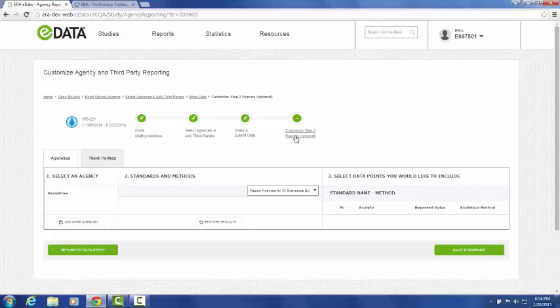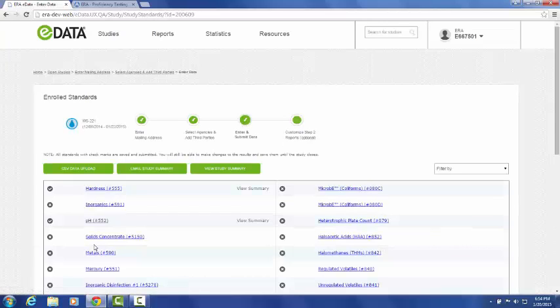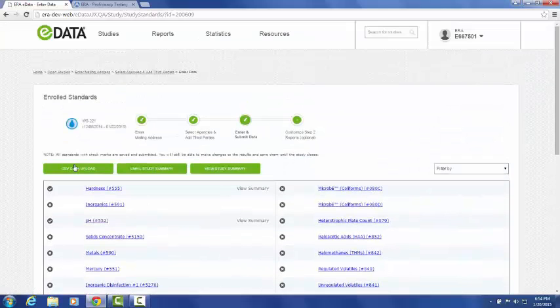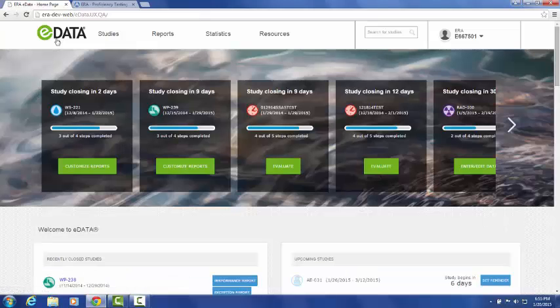If you do have questions about completing and customizing your reporting requirements to your various agencies, please contact ERA's PT group and I'll provide their contact information following the webinar. So let's go back to the data entry menu. Now once you've completed your data entry, you can use either the button provided to return to your open studies, or you can use the breadcrumbs at the top of the page to return to the home, or you can also click on the eDATA logo at any time to return to the home screen in your PT dashboard. And with that, we have completed the process of reporting data for an open study.